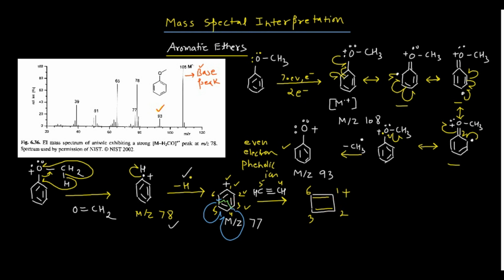If you want, you can write the m/z value of this one. This will correspond to an m/z value of 51. Okay, so 12, see how you can count this 51.